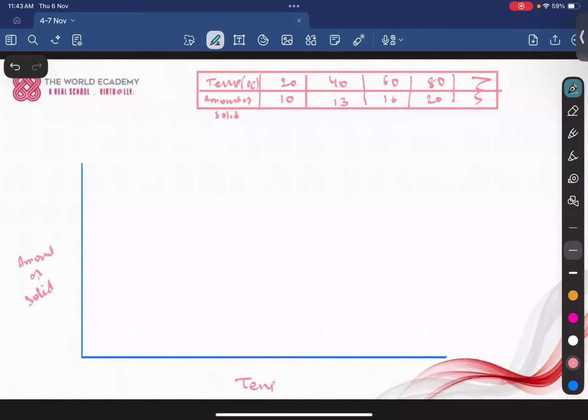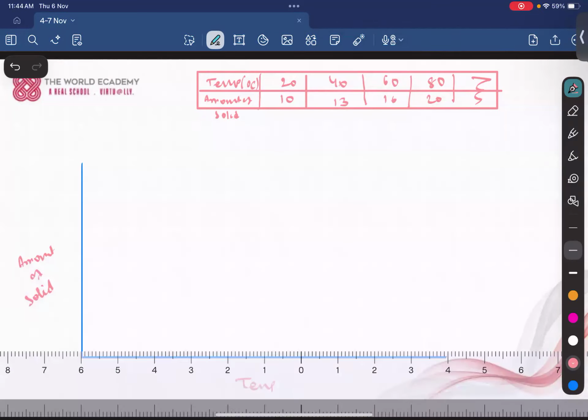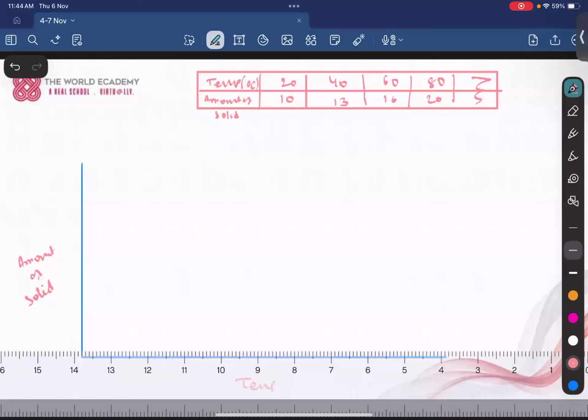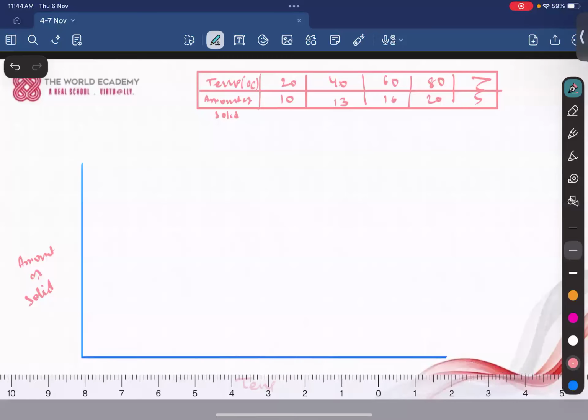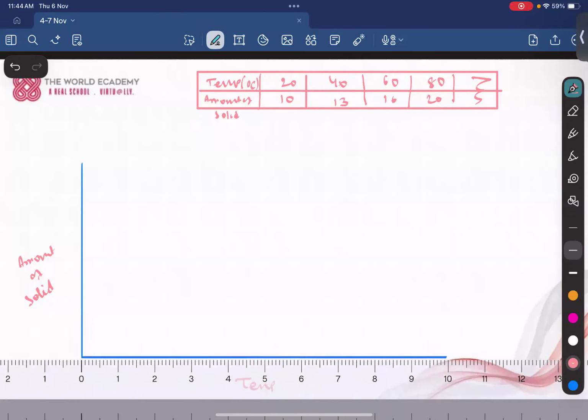of solid dissolved. Now, how to understand the scale? So we need to divide this in different sections. So again, we need the ruler. We are taking the ruler. Where is zero? Oh yes, this one is zero. So let's take this as zero because this is the origin and we need to put zero in origin.